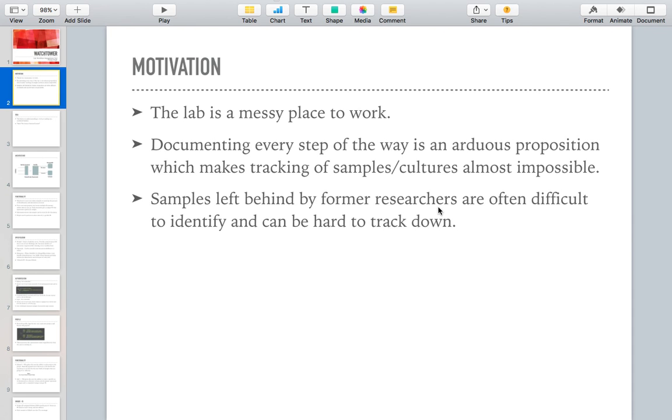I feel like I took the first step in solving that problem, in that I have a good groundwork to tackle that problem, but by no means is it finished. So as I said, these were the points for which I made this. So the way I like to describe this project is that it is actually a source version control for biology.